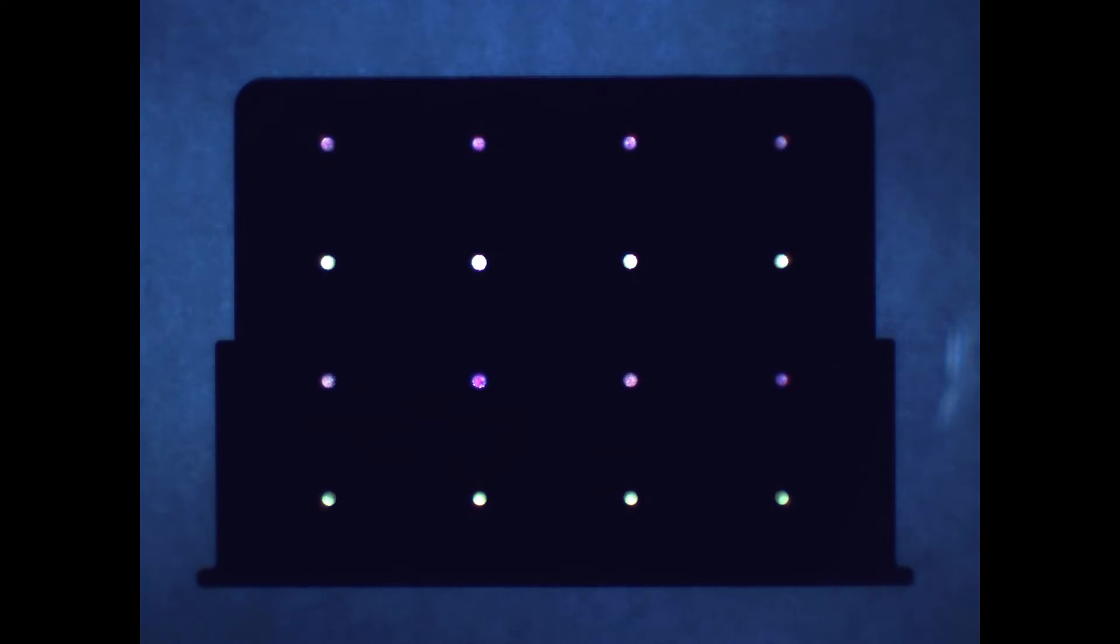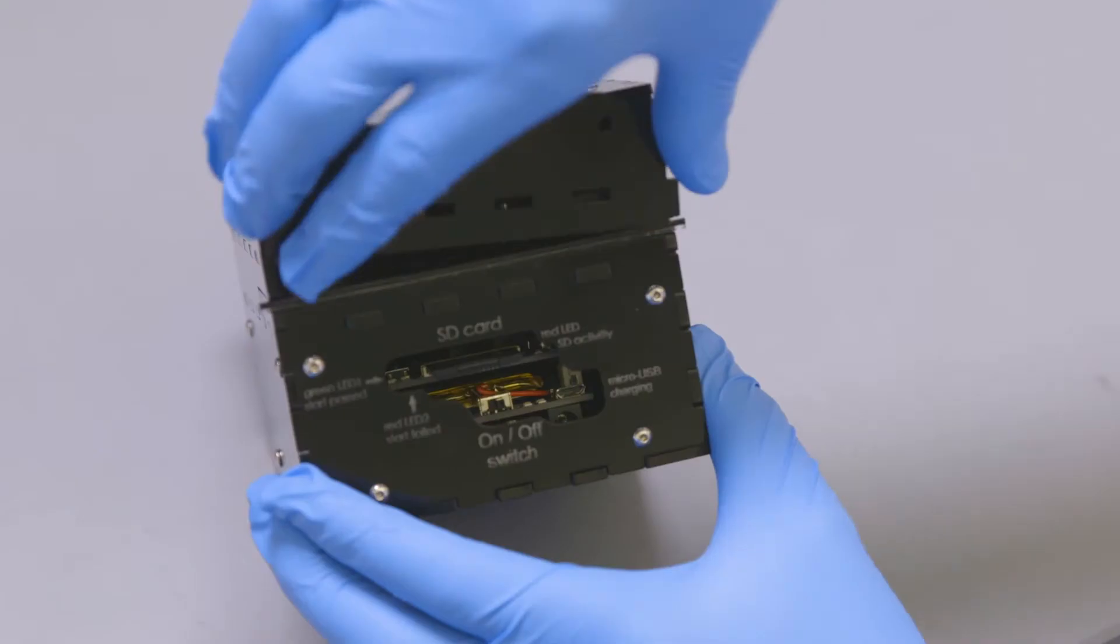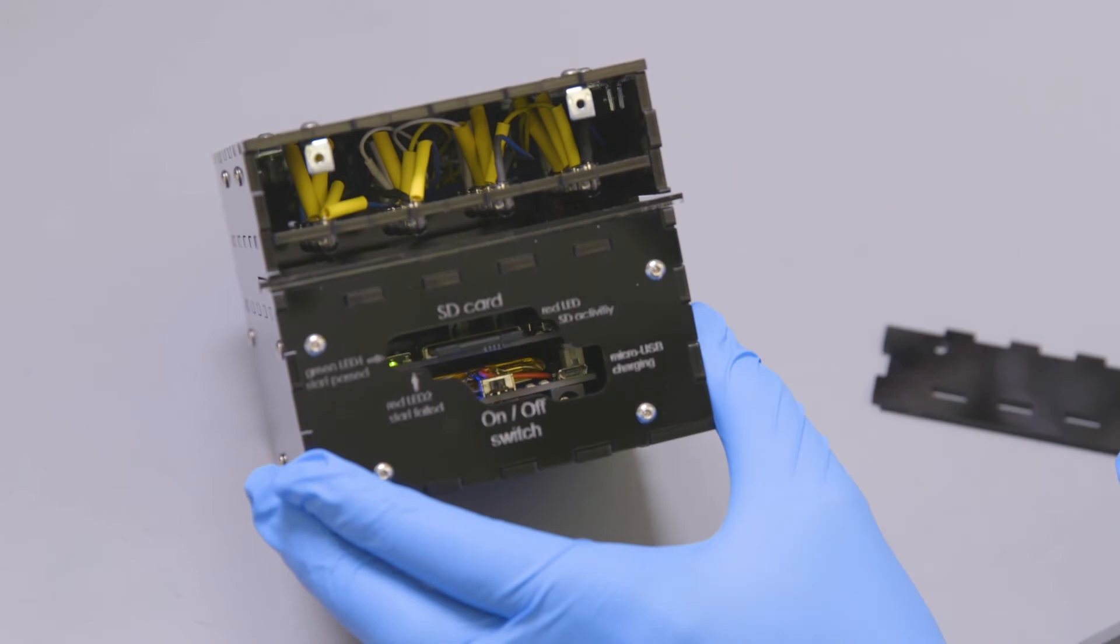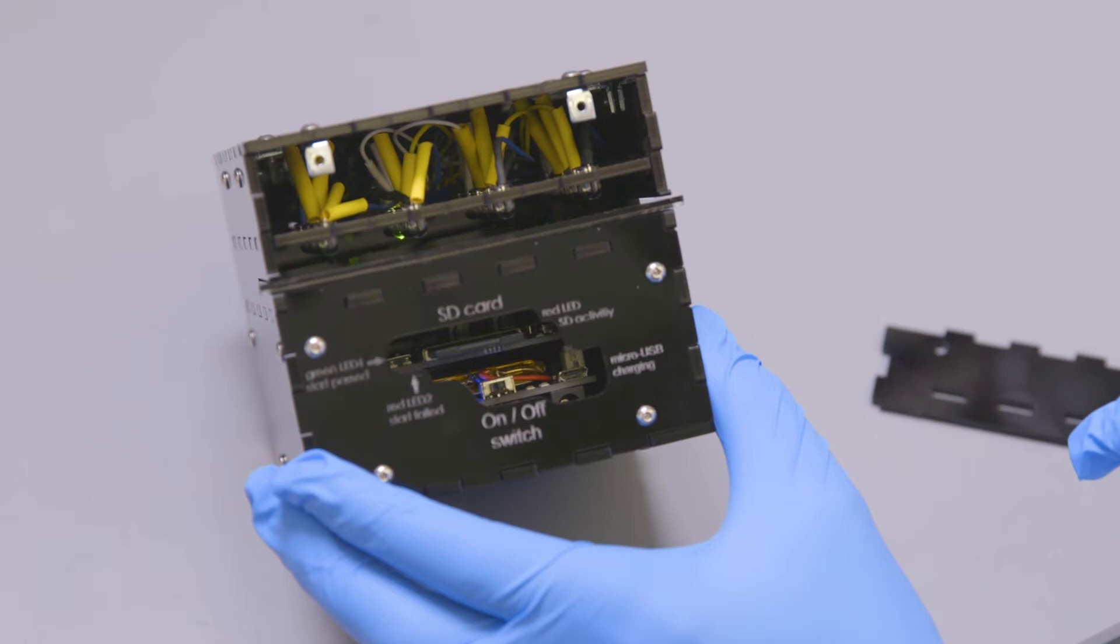The components of the reader are as follows. The first layer is the LED layer. As the diagnostic reactions proceed, the light from the LED is blocked from shining through the paper. The LEDs are turned on one at a time to ensure minimal well-to-well crosstalk.